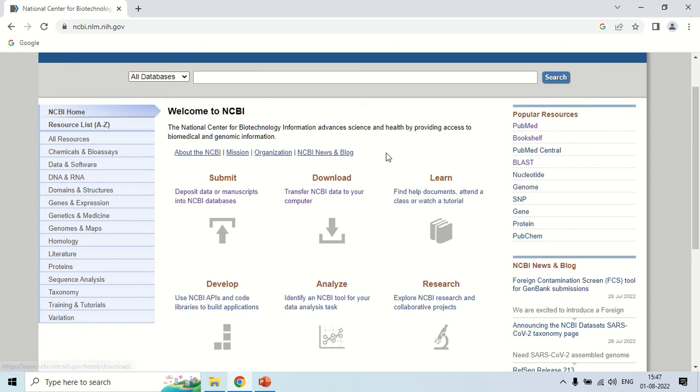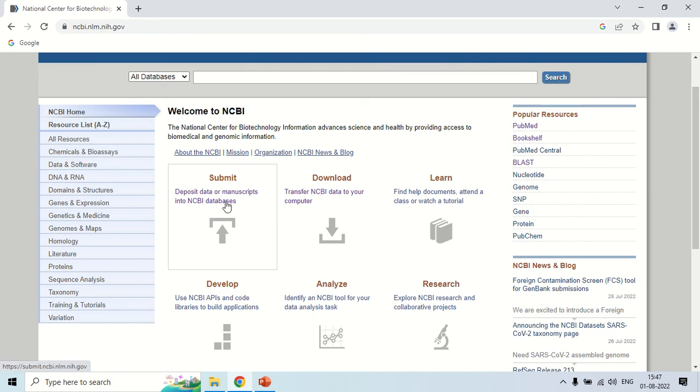Here is the submit button. If you want to submit your sequence to NCBI, you have to click here and after following a complete process you can submit your sequence to NCBI.